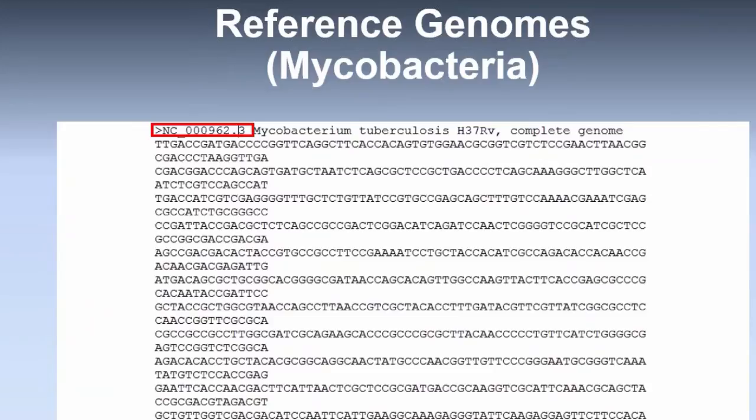So that's a fairly useful thing to know, I think, right now. One thing to remind you guys who are doing that kind of work is that remember the accession in the FASTA has to match exactly with the accession in the GFF3 or GTF file. So right now, I would suggest not mixing annotations from UCSC or Ensembl with genomes from NCBI, although we do intend to make a converter in the near future.